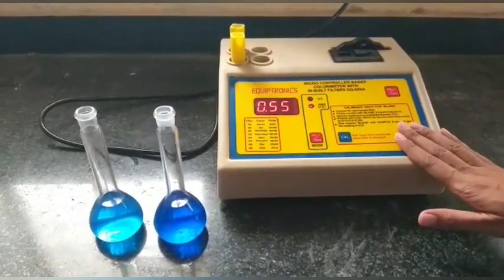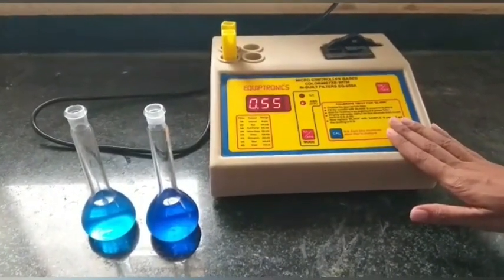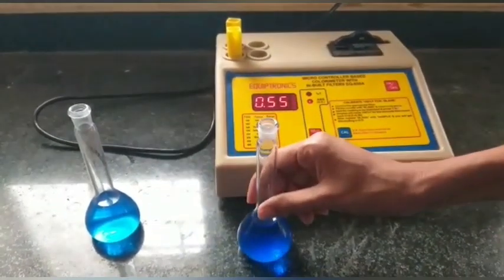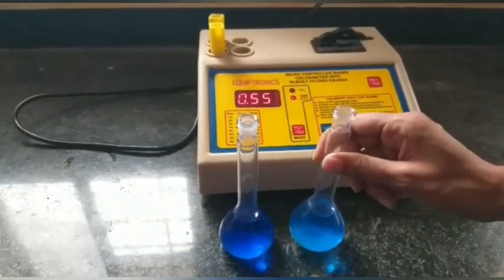In colorimetry, we have the principle Lambert Beer's law, and this principle shows the color of the solution and absorbance. From this color solution we get the absorbance and transmittance readings.